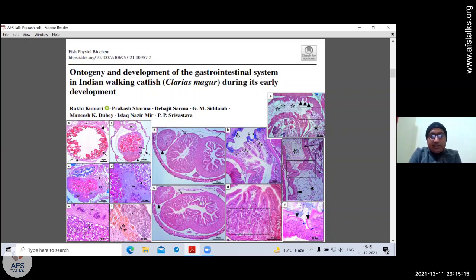Yeah. So here I could see the cardiac sphincter. So clearly, different zonation. This is the esophagus and this is the stomach. Clearly these goblet cell patterns are indicating the cardiac sphincter. And then here in the E micrograph, we can see the pyloric sphincter. And in that paper, we could learn about the function of the pyloric sphincter.